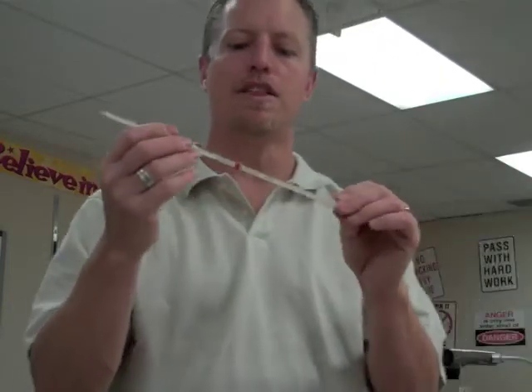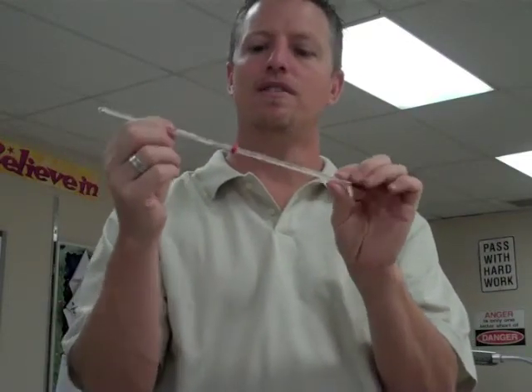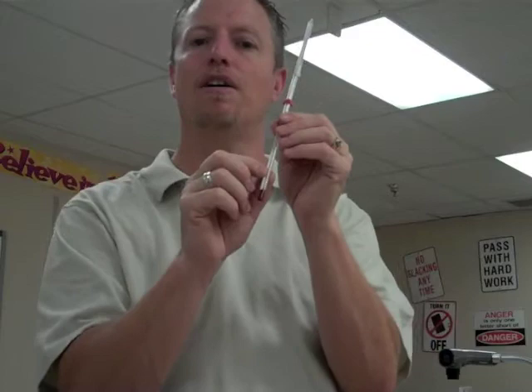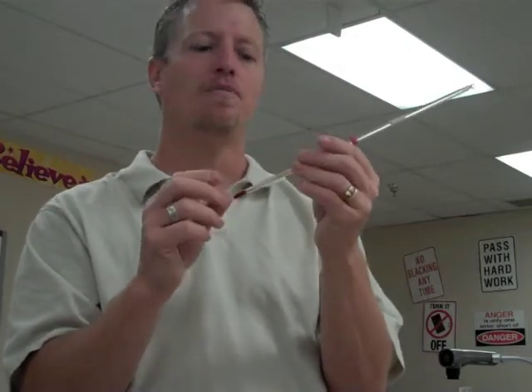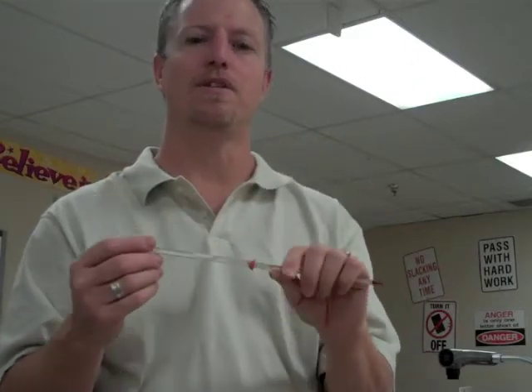This is just a thermometer — a Celsius thermometer, because we use Celsius in science. The red bulb at the end lets me know this is actually an alcohol thermometer, and that is not toxic. We used to use mercury thermometers, which are a little more accurate, but if a mercury thermometer breaks, then you have a toxic substance to deal with.